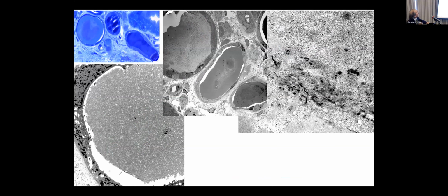As you can see here, that is the thick section reflecting the morphology we see in light microscopy. And here it's composed of variable structure with variable density, reflecting the duration of cast formation and probably the concentrations of the uromodulin. For example, that is the lighter area, the darker area. In that area, that is even darker and darker.